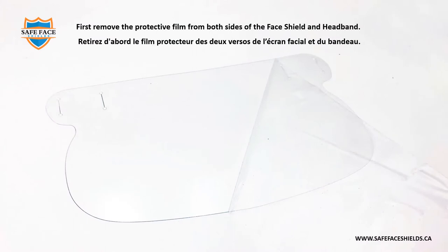First, remove the protective film from both sides of the face shield and headband. Retirez d'abord le film protecteur des deux versos de l'écran facial et du bandeau.